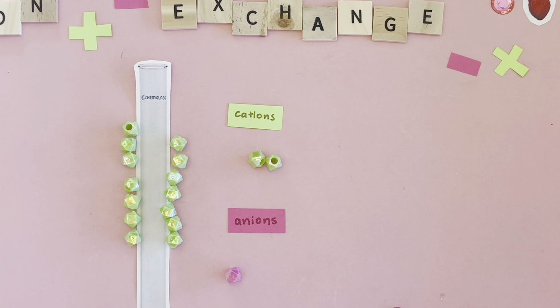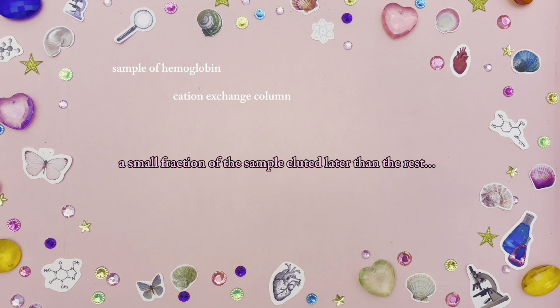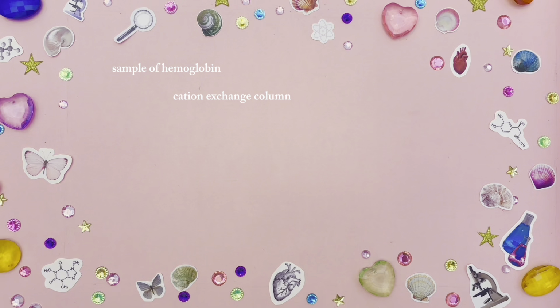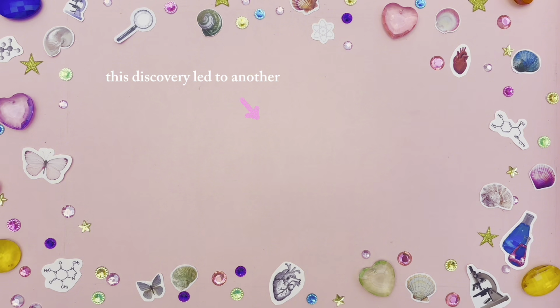Upon researching this method of chromatography, I came across an incredibly significant discovery made through ion exchange. When researchers passed a sample of hemoglobin through a cation exchange column in 1958, they noticed a small fraction of the sample eluting later than the rest. This was HbA1c, a glycated form of hemoglobin with glucose attached to the N-terminal valine of the B chain, slightly altering the molecule's charge. This discovery led to another very important one.